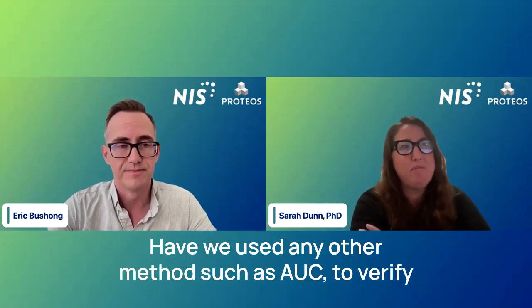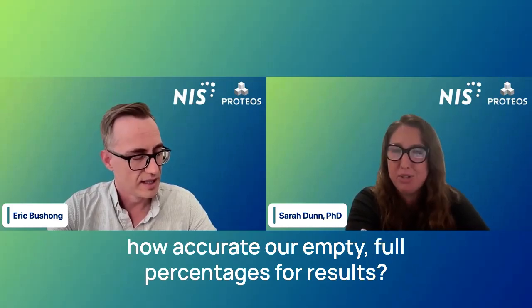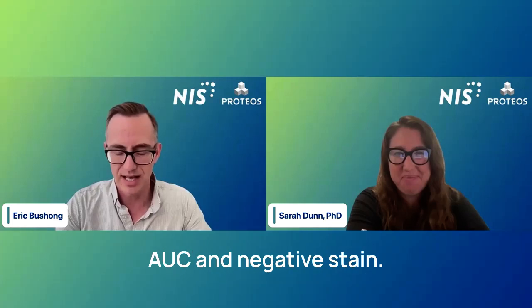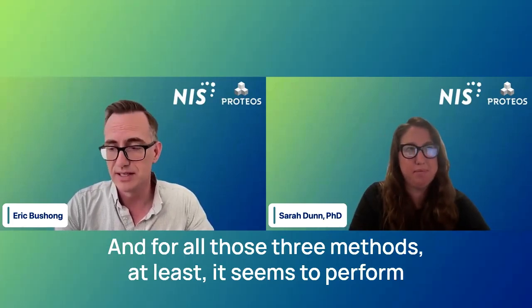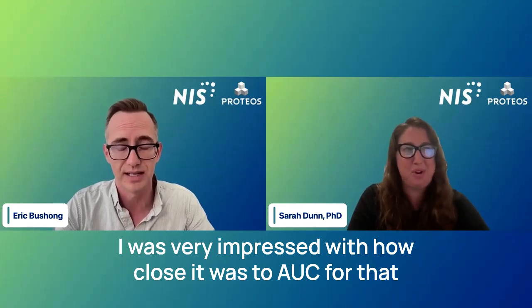Right. Have we used any other method, such as AUC, to verify how accurate our empty/full percentages are? I think maybe that was asked before I got to those slides. Definitely, yes. We've compared it to mass photometry, AUC, and negative stain. For all three of those methods, at least, it seems to perform very closely to what the other orthogonal techniques report, especially AUC. I was very impressed with how close it was to AUC for that linearity study that I presented.